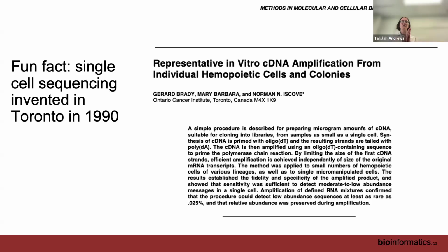And that will essentially let you estimate the contribution of different cell types to your bulk samples. Otherwise, you can compare the log fold changes of different genes and then see what cell types most express those genes and sort of guesstimate which cell types are most likely to be changing.